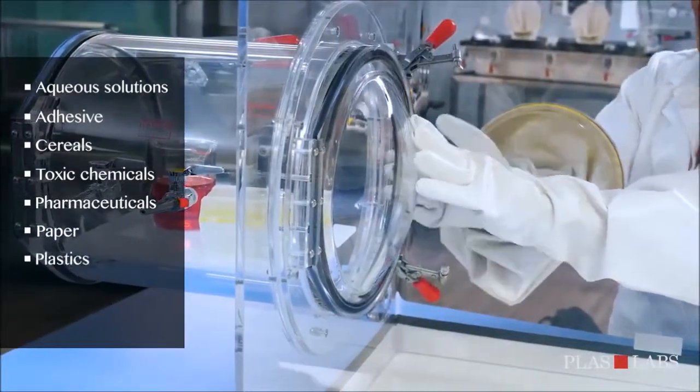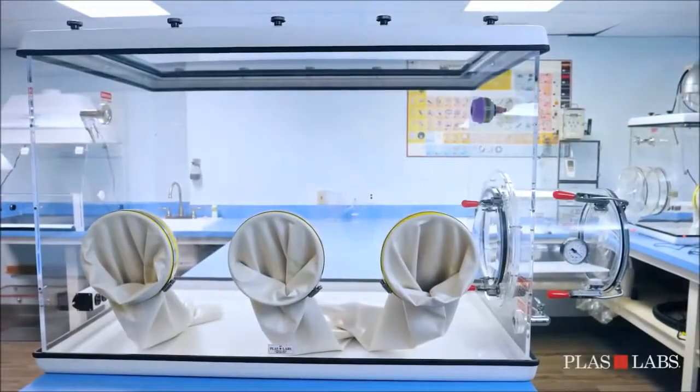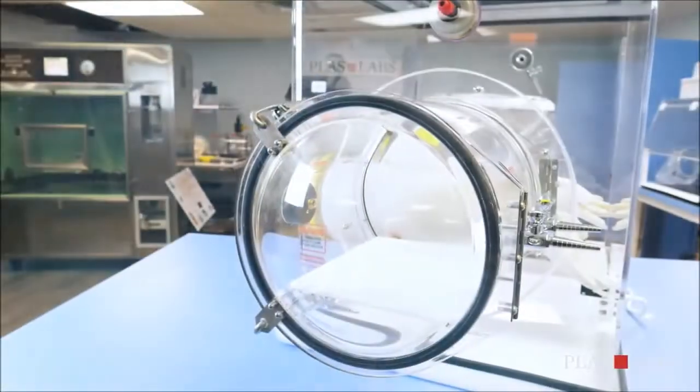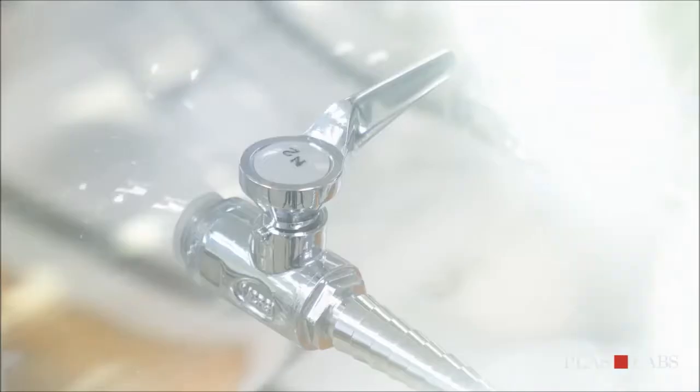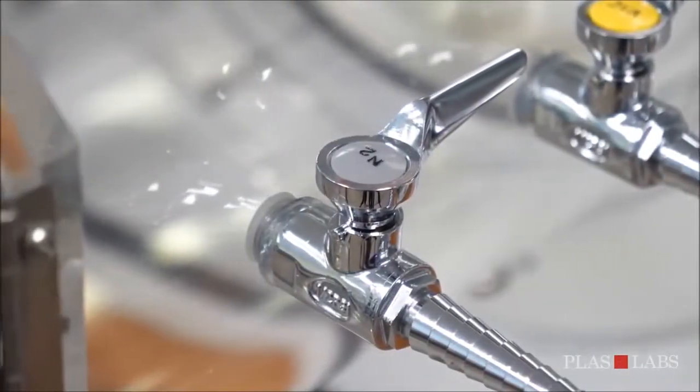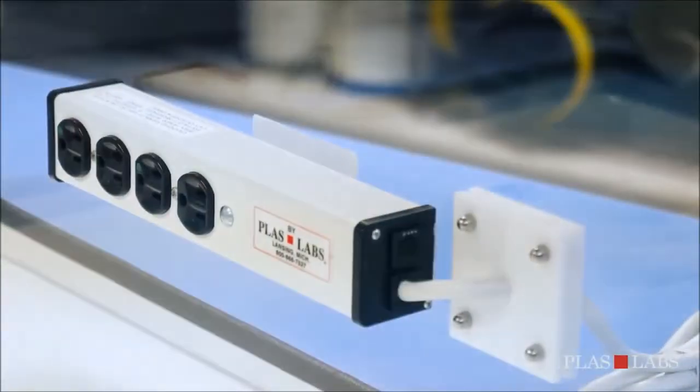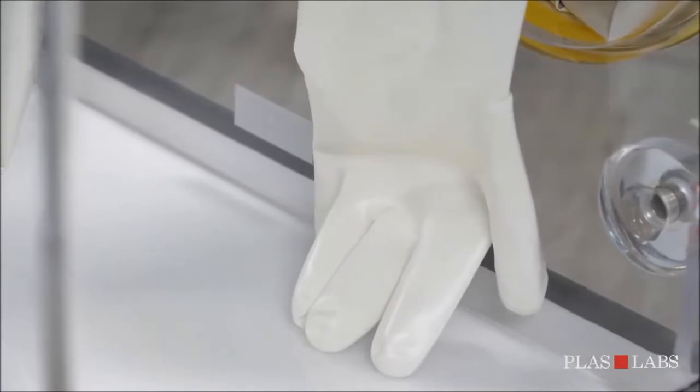Each 830 series glove box comes standard with transfer chamber with purging valves, pressure gauge and leveling tray, two purging valves on the main chamber, removable top, electrical outlet strip, white ambidextrous Hypalon material gloves, and small pressure relief pop valve with a small HEPA filter.